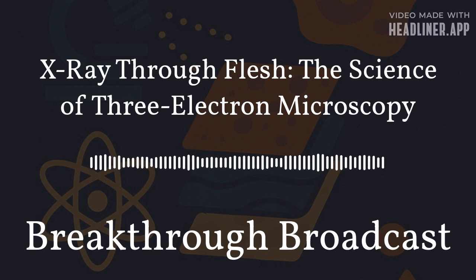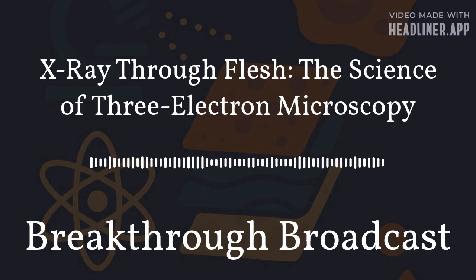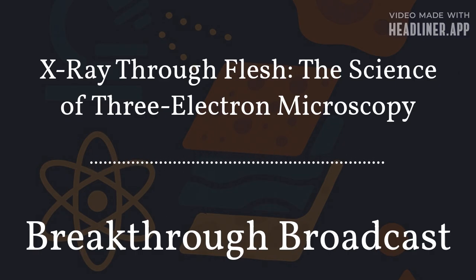Each of these interactions carries different information about the material when the electrons eventually return to the microscope. Traditional systems usually relied on only one of these interactions, or, in more advanced setups, two. When we incorporate three, this allows the microscope to detect the surface, the density, and the internal layers of the sample, all in one go. The three signals involved are called secondary electrons, backscattered electrons, and transmitted electrons.